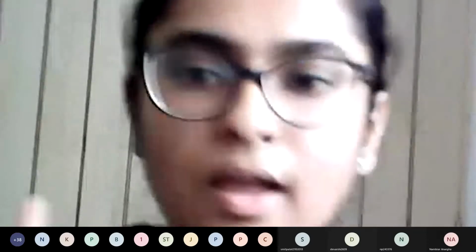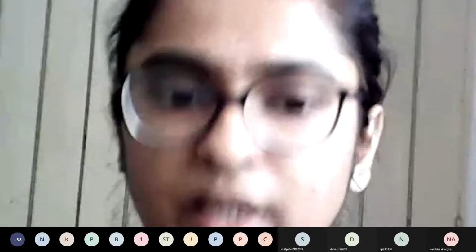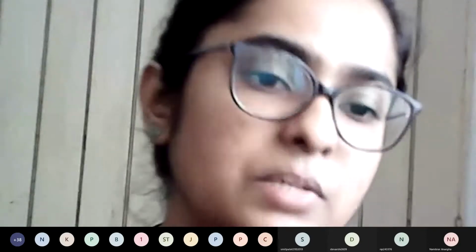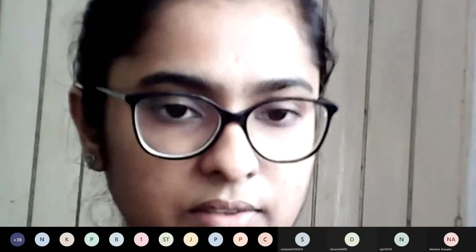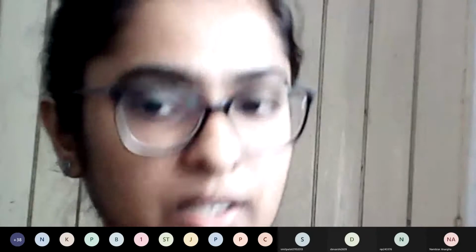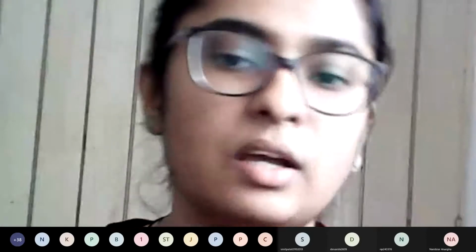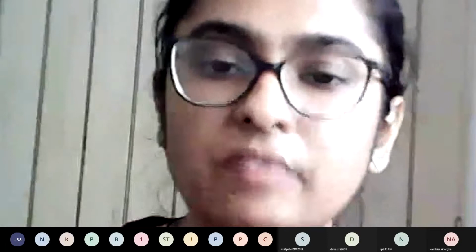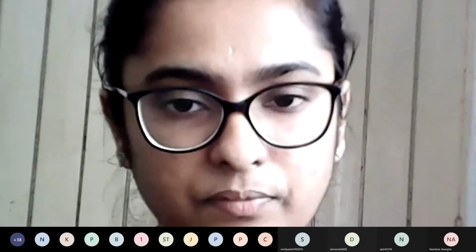I think I'll go ahead. Okay, see, what is our aim? We want to find Fe. In this case, we just want to find how much ferrum is present inside our sample. We know our sample is containing iron. We added EDTA, excess EDTA. So what will happen under the normal circumstance, room temperature, EDTA will go and selectively bind with Fe ions present in your sample.